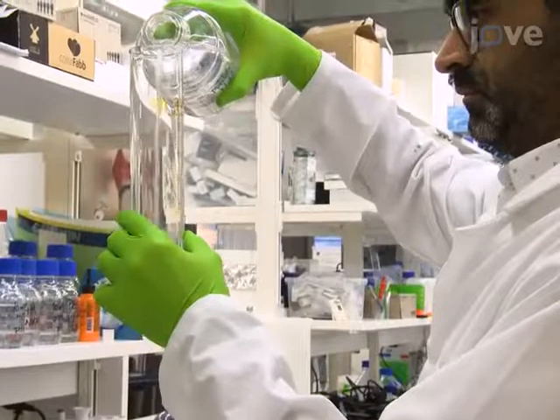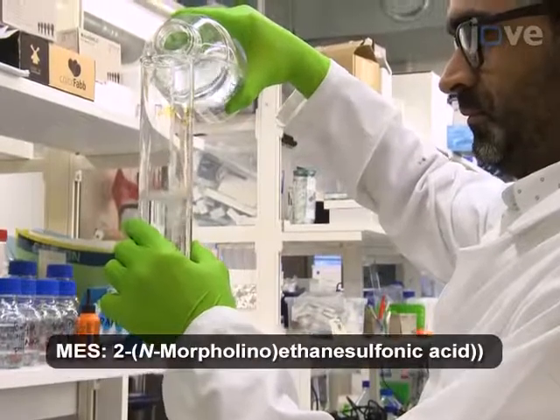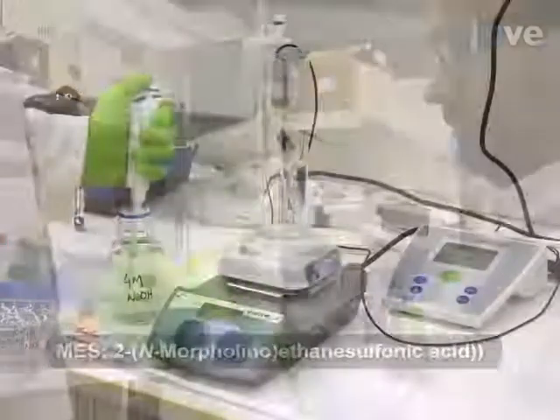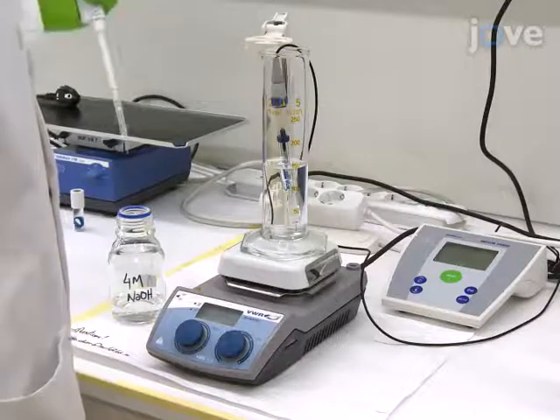To begin the procedure, prepare at least 10 milliliters of a 10 millimolar MES solution in deionized water. Adjust the pH of the solution to 6 with a 4 molar sodium hydroxide solution.